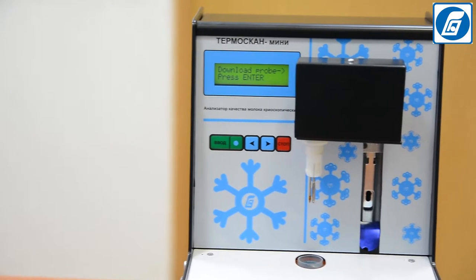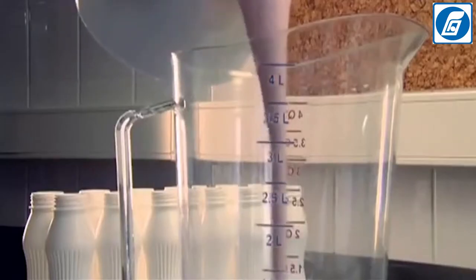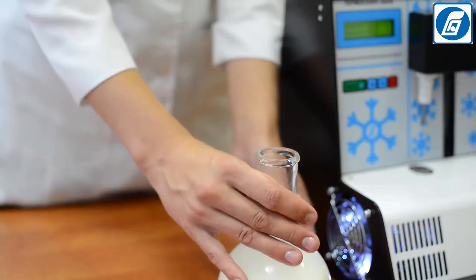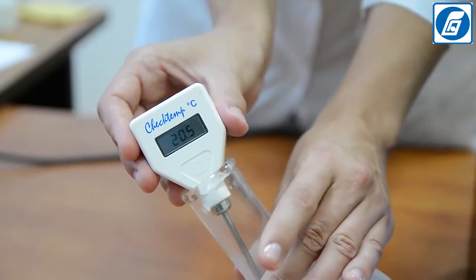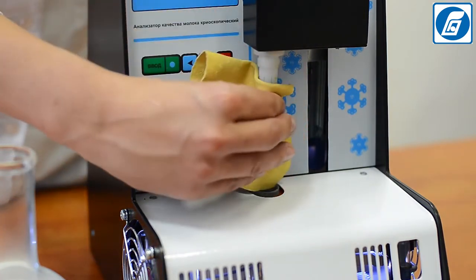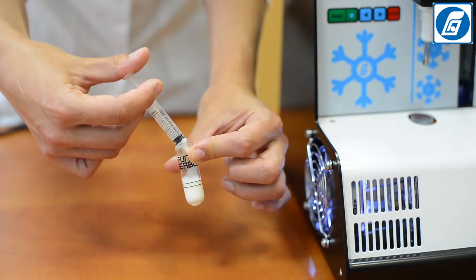Now we will demonstrate how to test a milk sample for determination of the freezing point. Select and prepare the milk samples — it is preferable to analyze samples immediately after selection. Carefully turn and rotate the container with the milk sample several times to mix its contents. Milk for the analysis should be at 20 degrees. Make sure the probe and stirring wire are clean and dry; if necessary, wipe them with a soft, clean, non-fibrous tissue. Pour or transfer with a pipette 2.5 ± 0.1 cubic centimeters of milk into a clean, dry test tube.